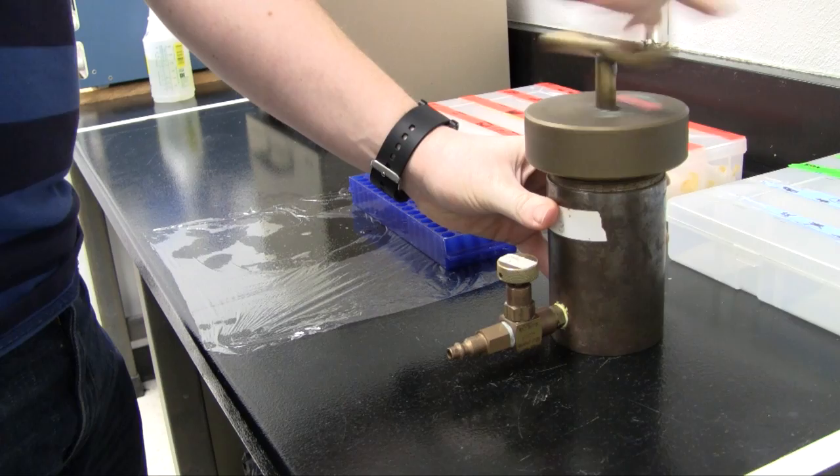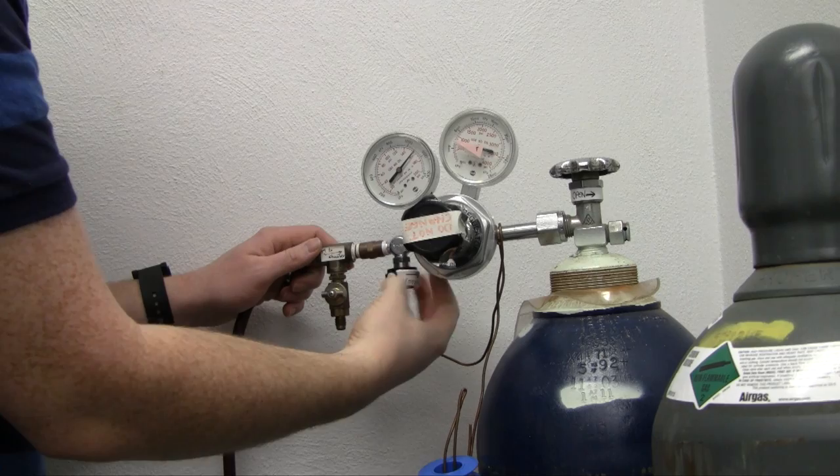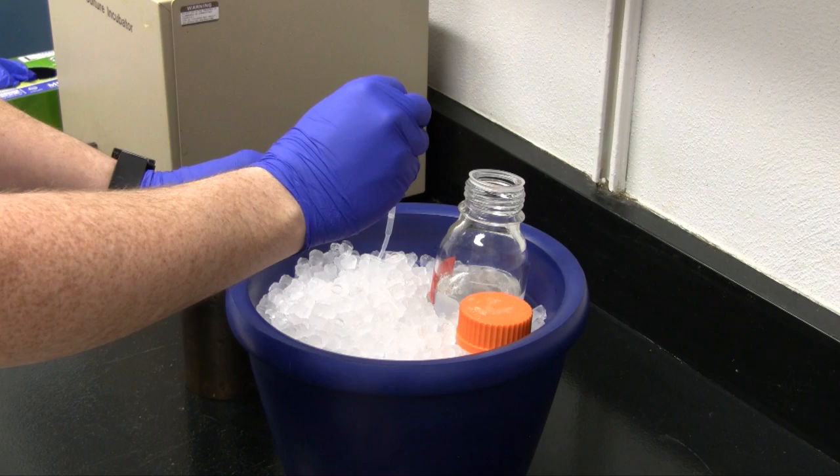The chamber is then filled with nitrous oxide, and the roots are treated for 1 to 3 hours. It is not necessary to purge the existing air in the chamber when adding nitrous oxide. After venting the nitrous oxide in a hood, the lid is removed and the tubes are opened and placed on ice. Pre-chilled acetic acid is quickly added to the roots to keep the cells in metaphase. Enough fixative is added to cover the roots and the tubes are left on ice for 10 minutes.